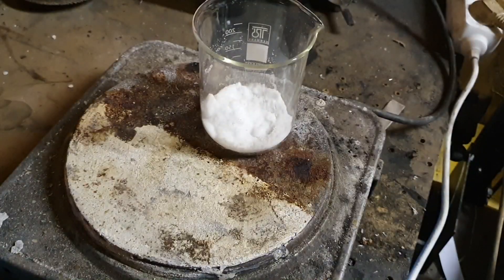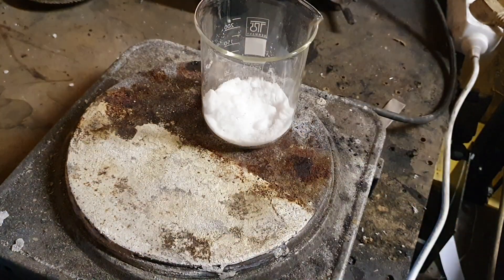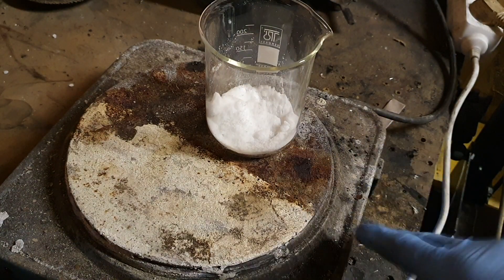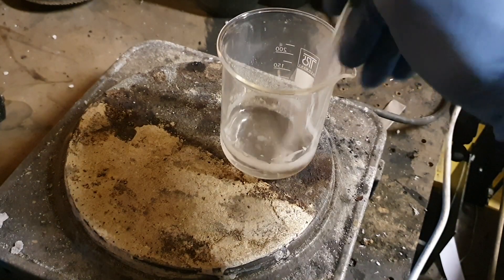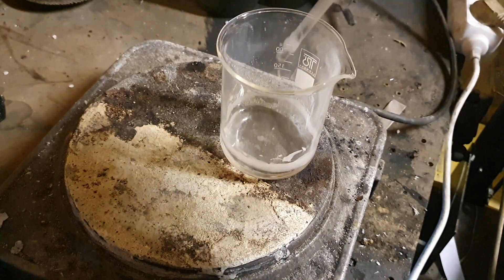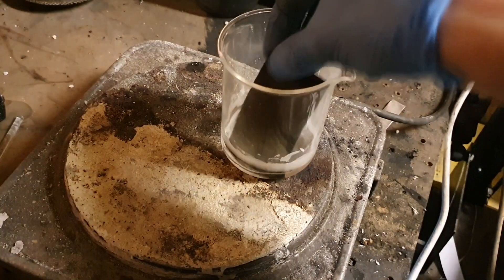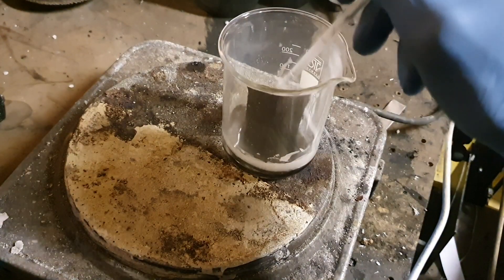Here in this beaker I have some urea, and this urea I put on a hot plate. The temperature I will use right now is 135 degrees C, because I want this urea to be melted. Now I've reached 135 degrees C and the urea is entirely melted. Into this melted urea I will put my carbon felt and soak the urea into this felt.